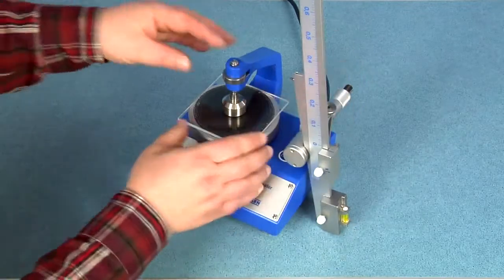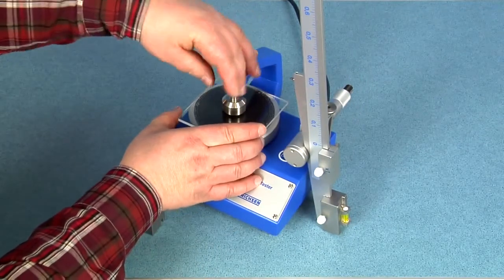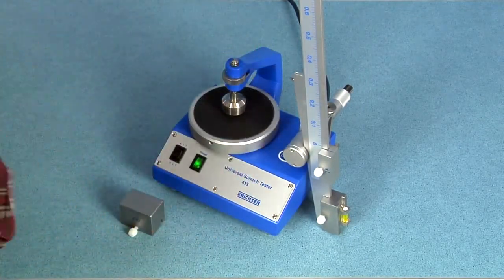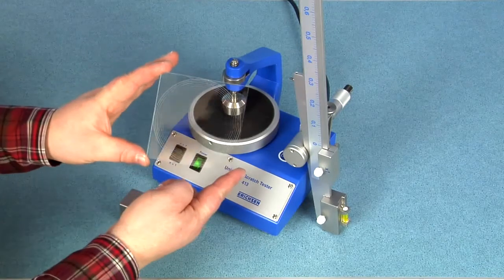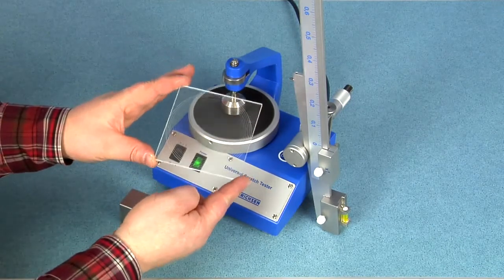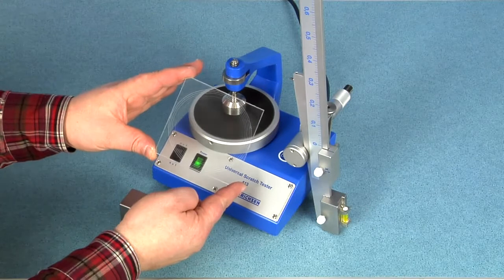Surface quality in numerical values. Quick and comfortable, precise, excellently repeatable, authentic and communicable values.